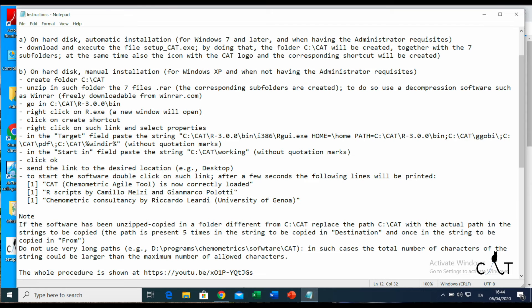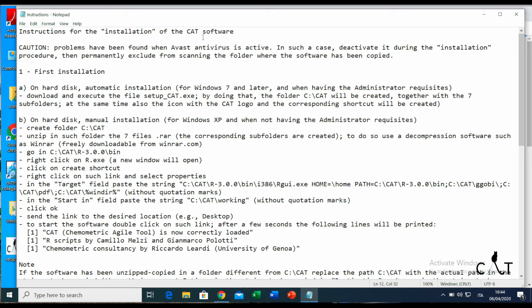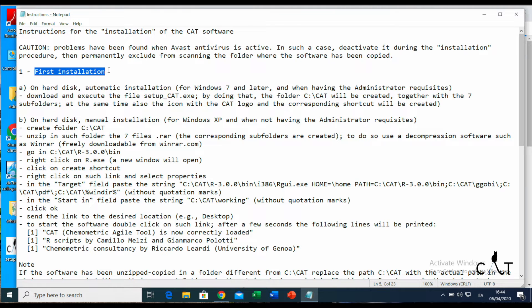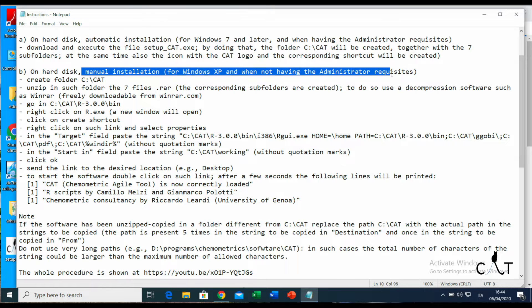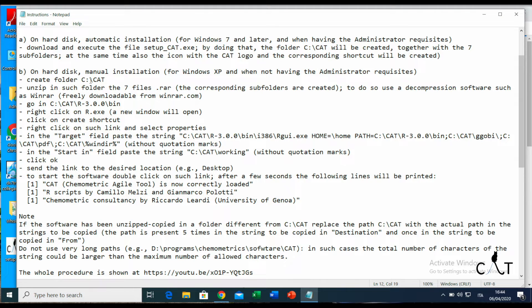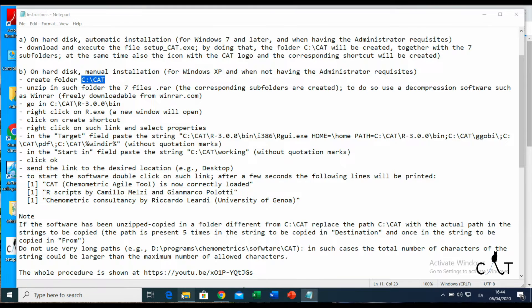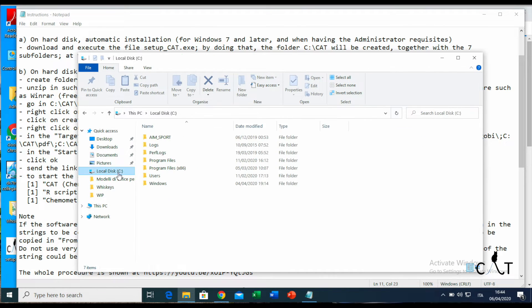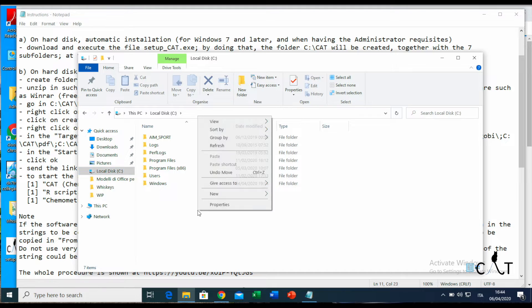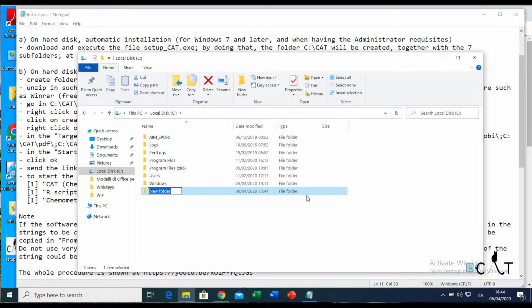Now, as you can see, it is the first installation and it's manual installation. I'm highlighting what we're going to do. So we go to folders, go to the local disk, create a new folder, and call it CAT.